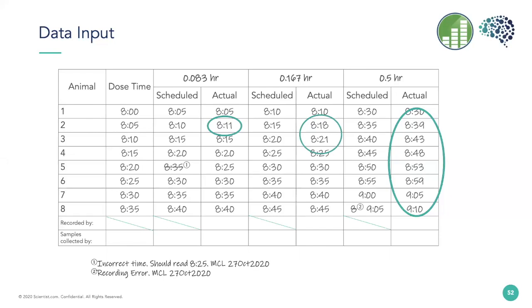And as a technician, you can write this down and make it look nice where nobody would notice, but you have to tell someone that a deviation has occurred. So I've notated the raw data now with my footnotes and gone and flagged it to direct them to my study note or my electronic record of what happened. And the system I used was exactly this. I wrote times on paper, then afterwards made a footnote. I had to call the study director, and then I went to a room somewhere with a computer and created an electronic note about whatever happened that caused us to be late.